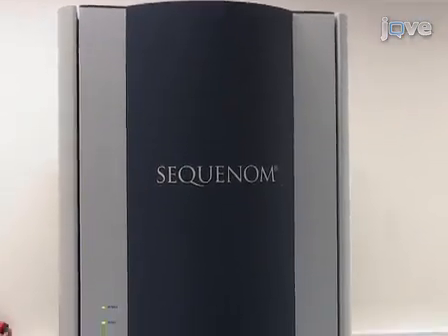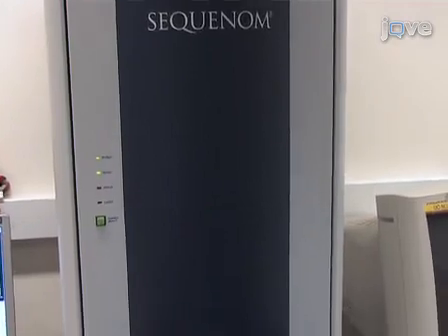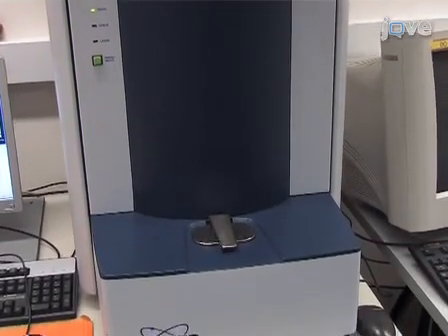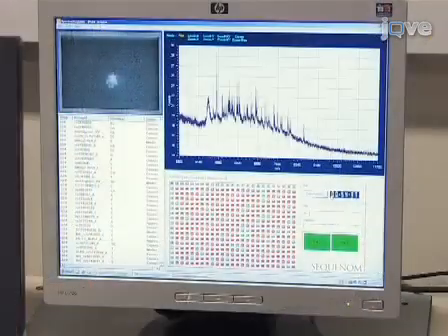Finally, the extended oligonucleotides are quantified by matrix-assisted laser desorption ionization time-of-flight mass spectrometry using a spectroreader mass spectrometer. A key point of this protocol is to use several strategies to control for experimental noise. To rule out artifacts, it's really important to repeat the experiment at least 3 times.